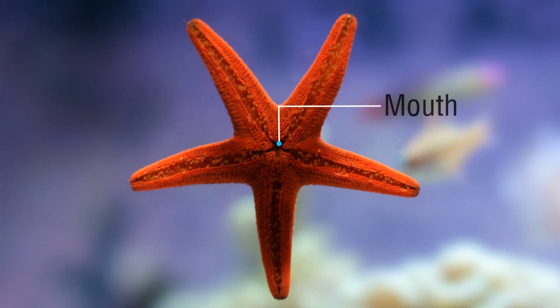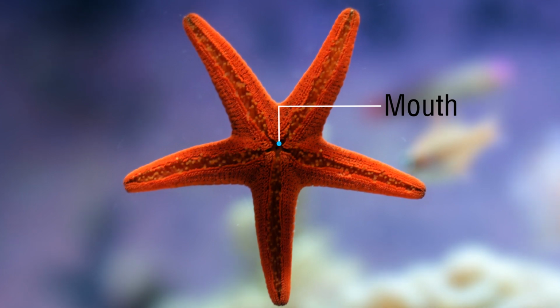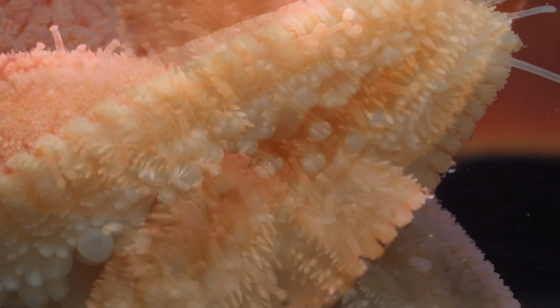Radiating from the mouth, there are 5 grooves, the ambulacral grooves, which continue in the 5 arms on the oral side. Special organs called tube feet are present in these ambulacral grooves.